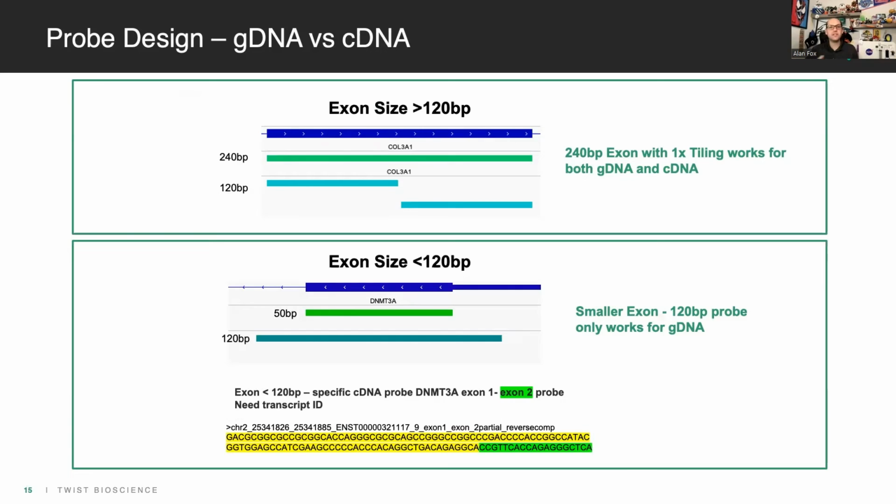And a lot of people really like that flexibility, where it's not like I only have to make an RNA library prep or I only have to make a DNA library prep. At least you're doing the same thing all at once. You just have to do the reverse transcription ahead of time. And the other good thing with this as well is, let's say you want to not use our library prep and use like 10x single cell, whatever RNA-seq library prep that 10x offers. You can still put that into our hybridization system as well. So we've seen a lot of designs against 10x, just trying to pull out those alternative transcripts and all that as well, because you have to sequence at a really high depth to really pull all that out. So if you only care about the number of transcripts, using a target capture based approach is a good way of going. This will come into play whenever we're designing the actual panel.